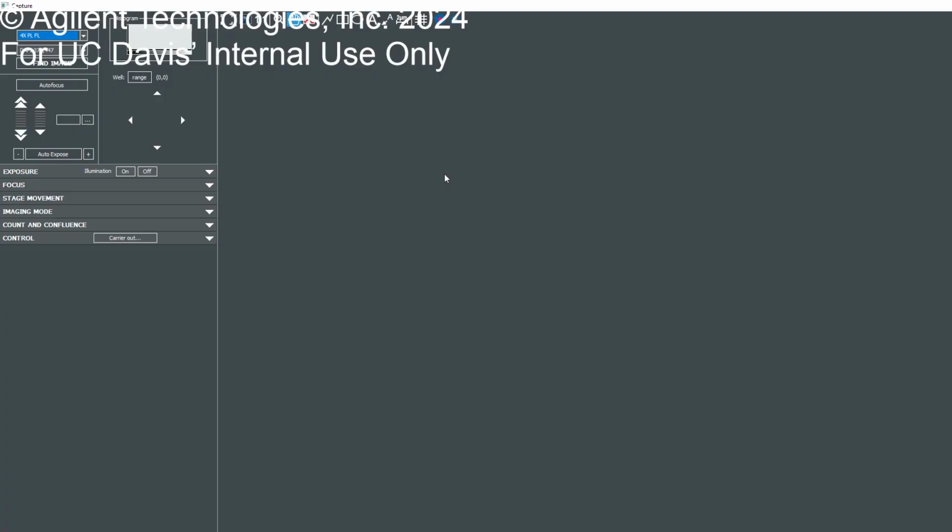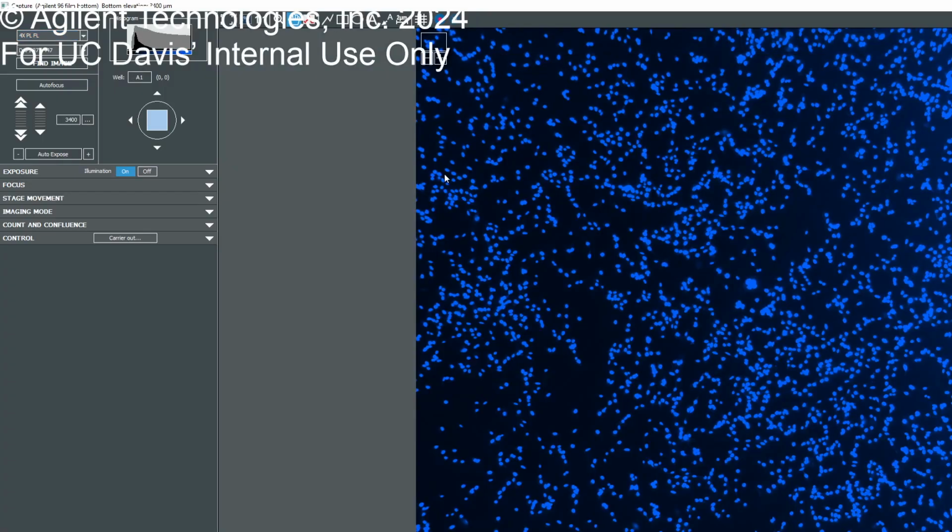And as you click OK, it's going to load up the plate for you and start up the reminder mode. Is it okay if I take a seat? Sure. It's easier for me that way. Okay. Alright.